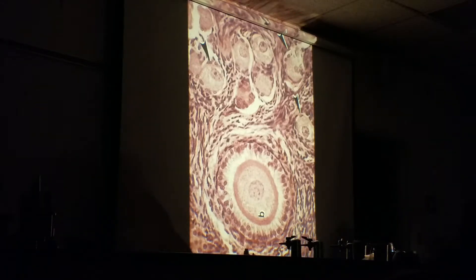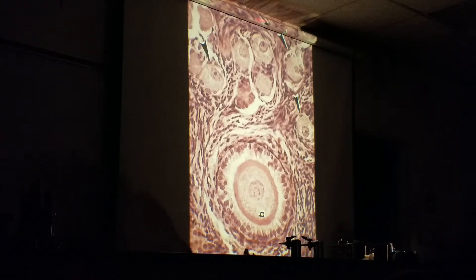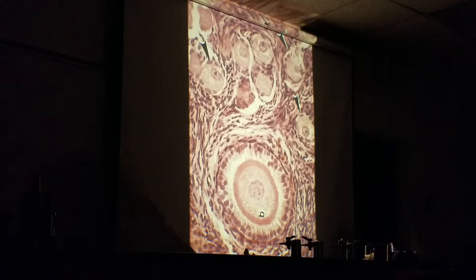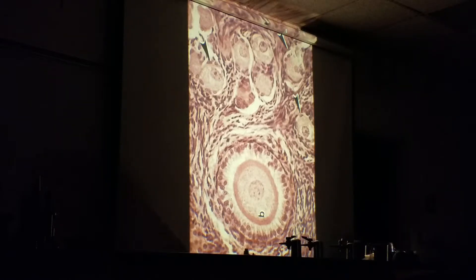Well, what's the layer up here called? The tunica albuginea — there's the T.A. We look at the albuginea, and then these cells right underneath it — right there — primordial.